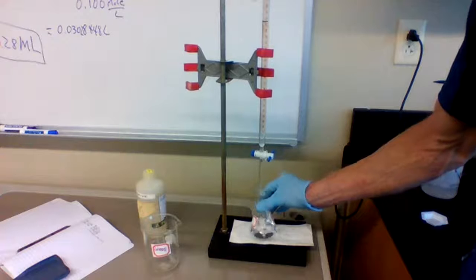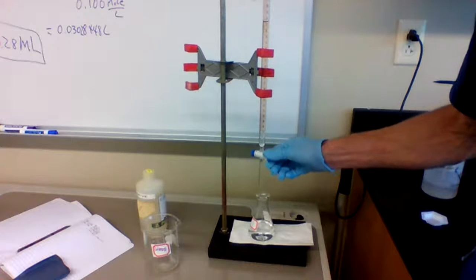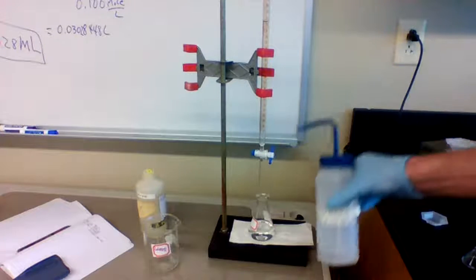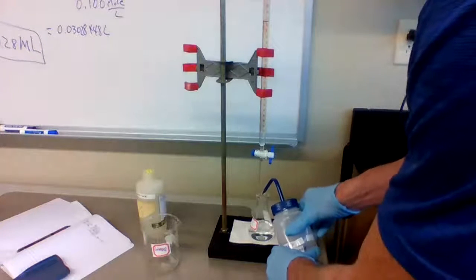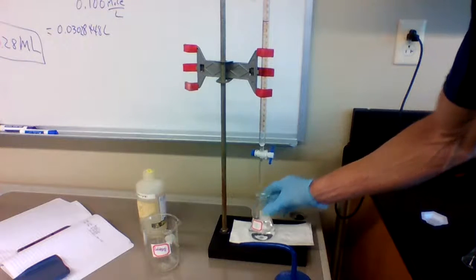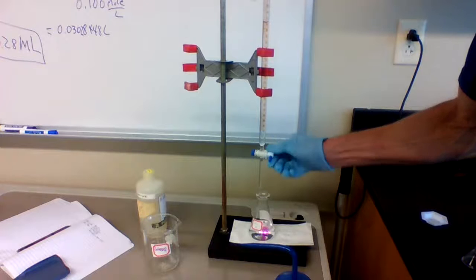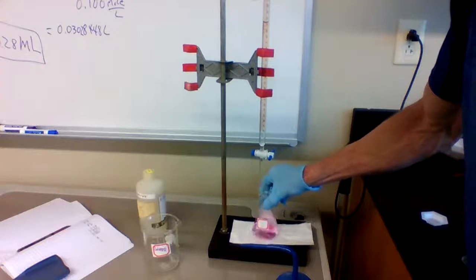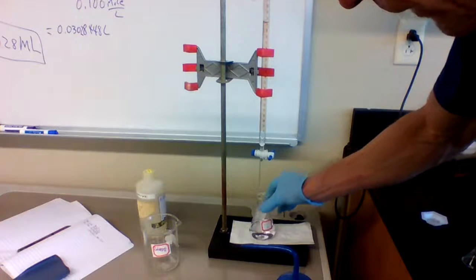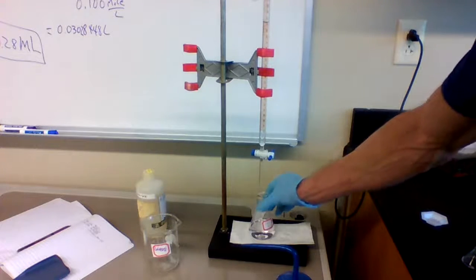Nope, still not there. Squirt in some water. Oh, uh-oh. You know what? I think I'm there.